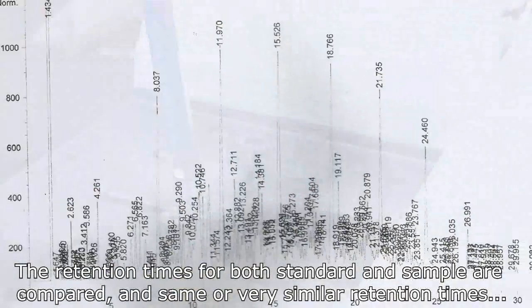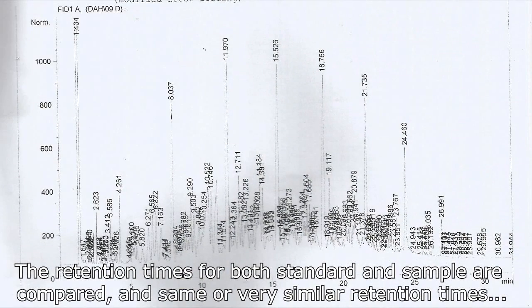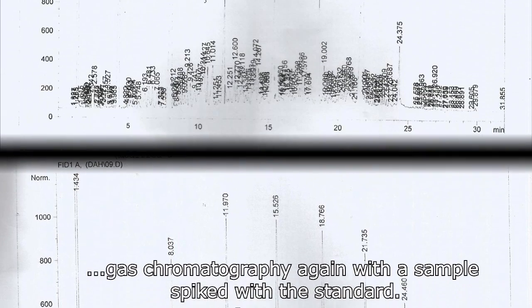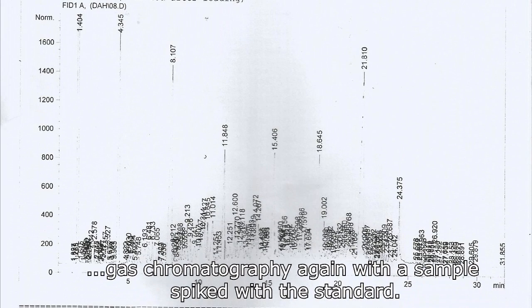The retention times for both standard and sample are compared, and those with very similar retention times are hypothesized to be the same analyte. In order to confirm the hypothesis, we must run the gas chromatography again with a sample spiked with the standard.